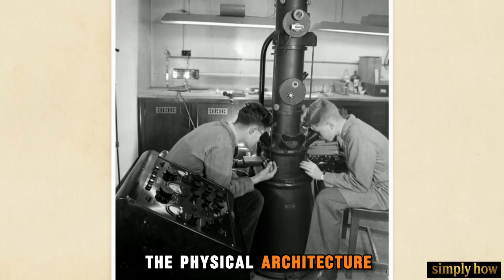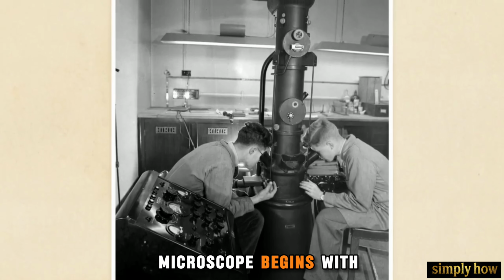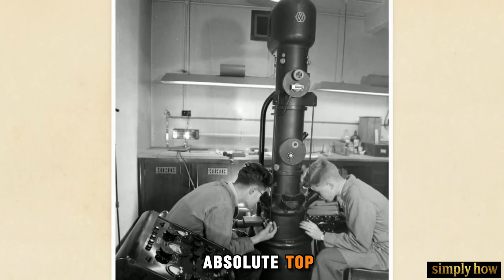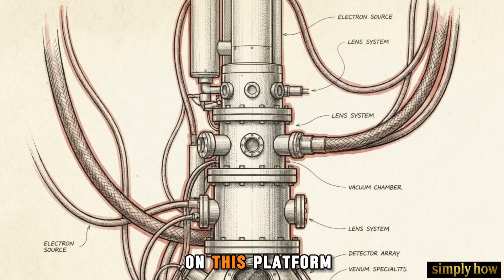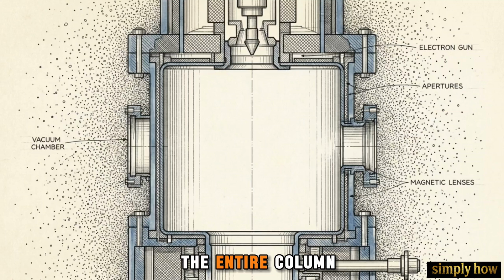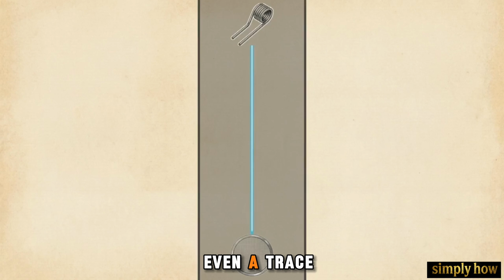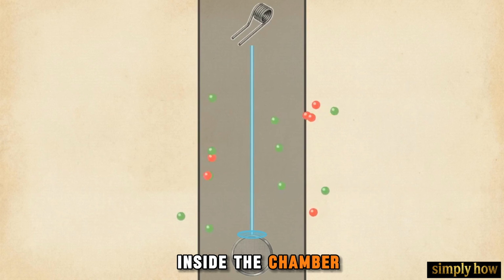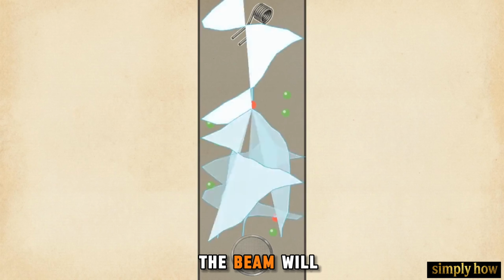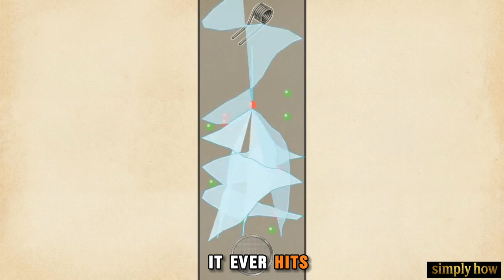The physical architecture of an electron microscope begins with this towering metal column, housing an electron gun at the absolute top. Every system built on this platform shares one non-negotiable operational rule. The entire column must run under an ultra-high vacuum. If you leave even a trace amount of air inside the chamber, the electrons will collide with oxygen and nitrogen molecules. The beam will scatter instantly before it ever hits the sample.